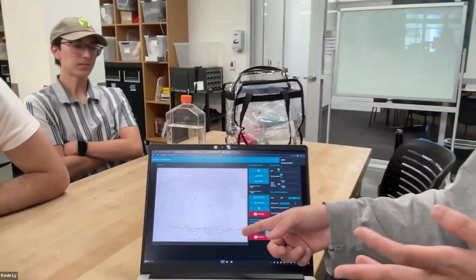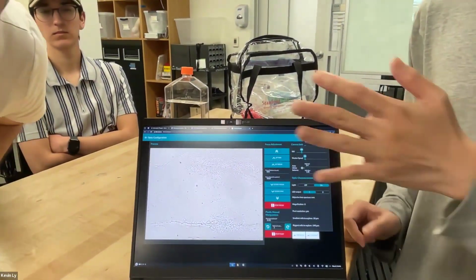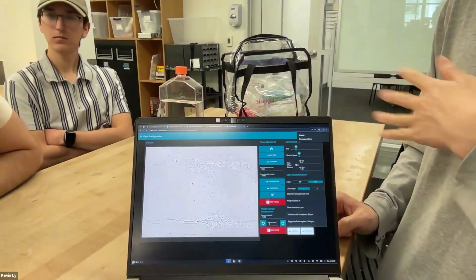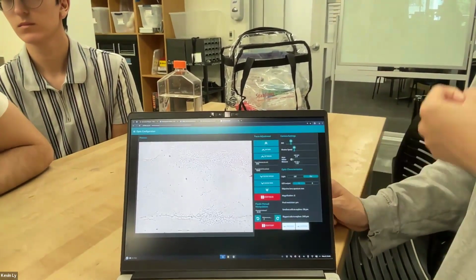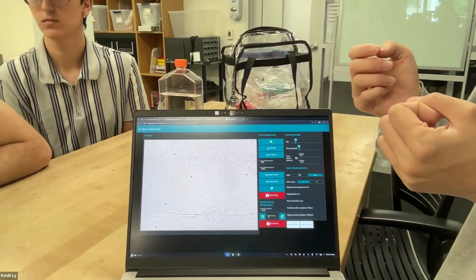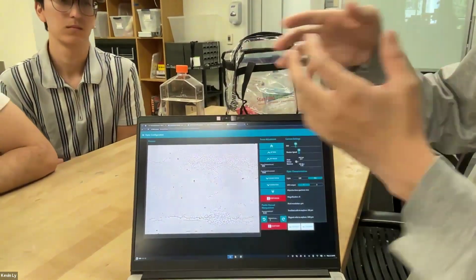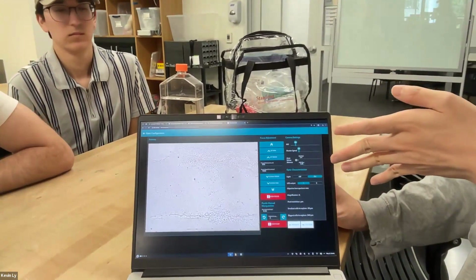This is like dust or dirt on the outside of the glass capillary tube. So basically the script estimates the background and subtracts it out from the images. And then what we're left with is something that we can apply a threshold to. And then there are some operations, like expand and dilate operations, to try to merge adjacent objects. And then there's a thresholding at the end.